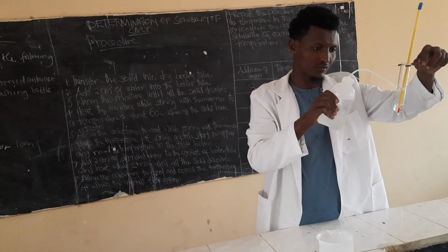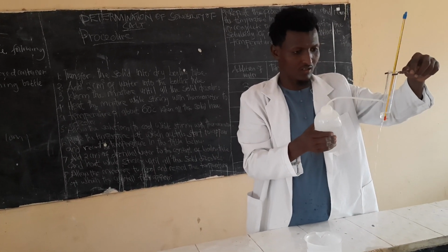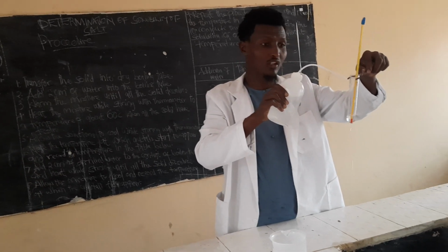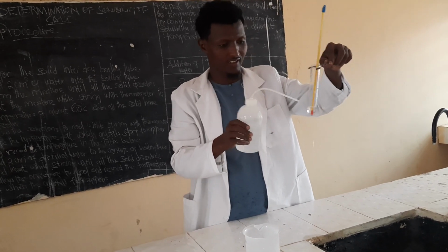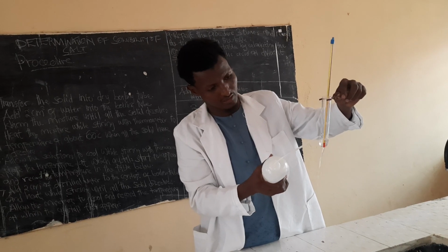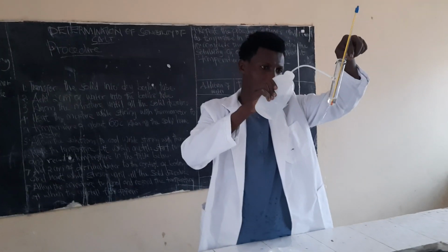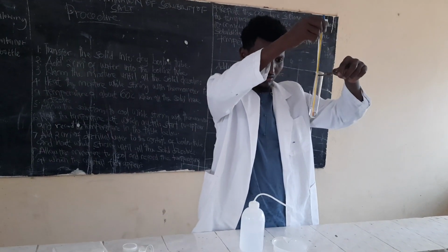Let us cool it so that it will form crystals. And make sure this water will not enter into the content. If it goes into the content, it will be a minus, a problem for you. So don't do that.